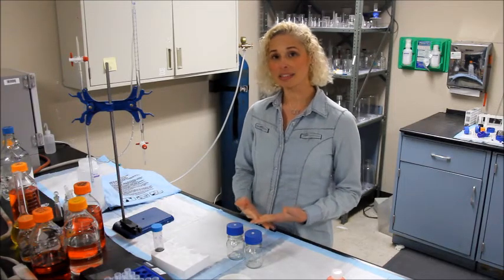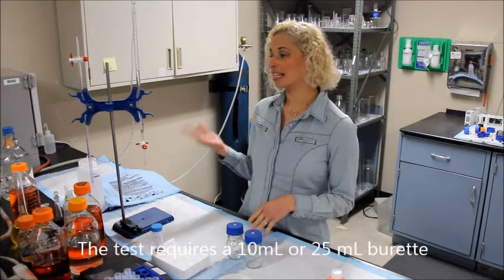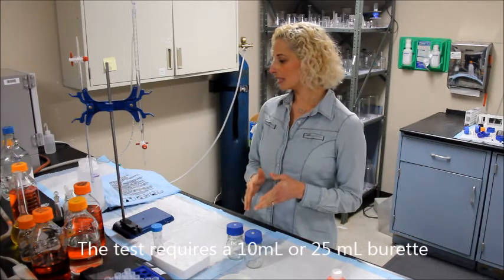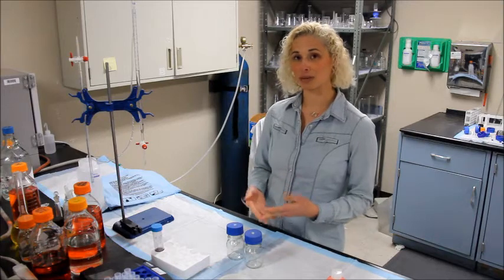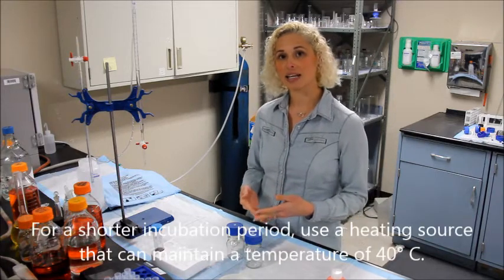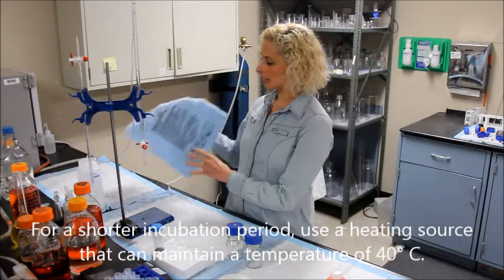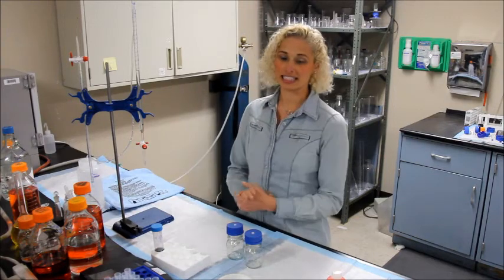The kit comes with everything you need to get started. However, you will need a 10 ml or 25 ml burette if you don't already have one. We also recommend, for faster incubation time, that you use a heating source that can get to about 40 degrees Celsius. We recommend using a heating blanket or any other source that can maintain a constant heat.